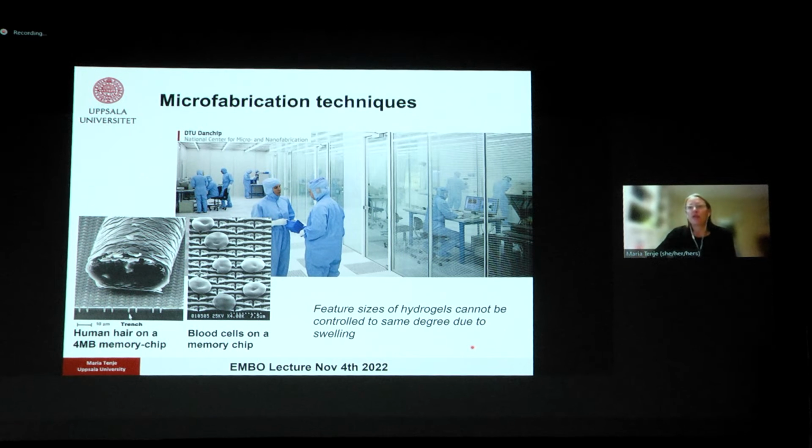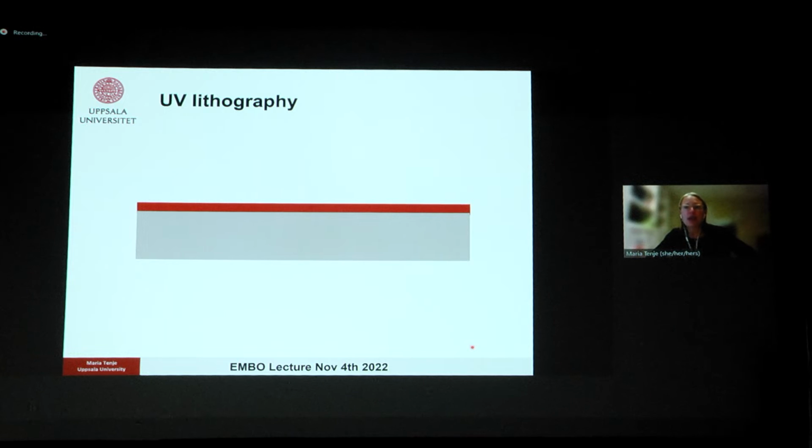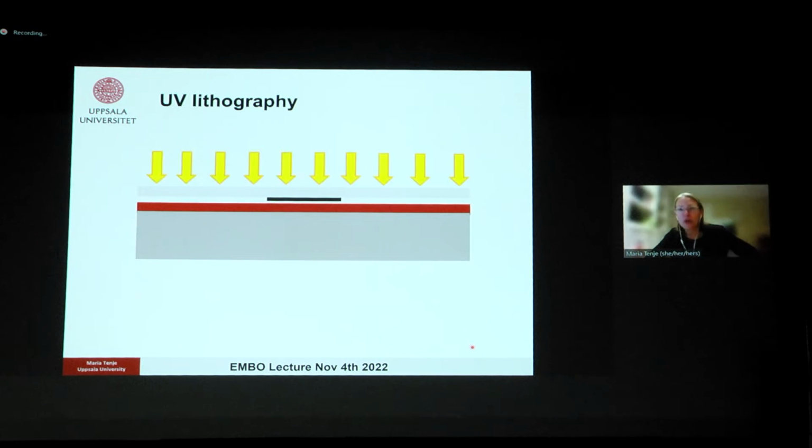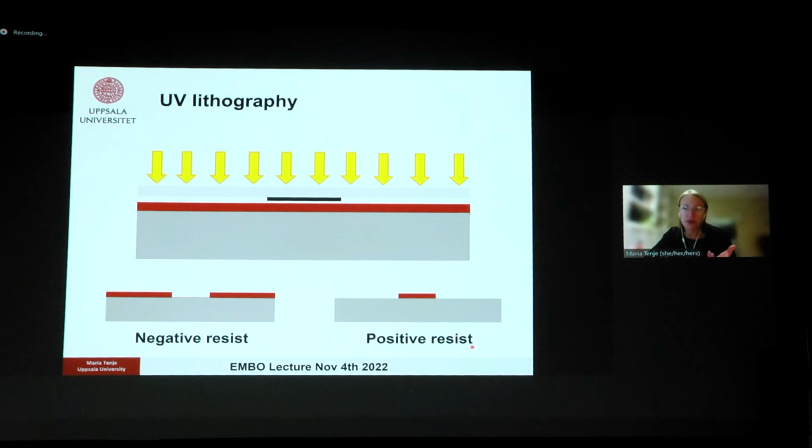And for microfabrication, really the workhorse is UV lithography. And just very briefly, imagine a cross-section: you have a substrate, you put a layer on top that is sensitive to UV light. You can bring in a mask and you expose to the UV light, and that can either form bonds if you work with a negative resist or a negative hydrogel, or it can break bonds if you work with what we call a positive resist, or a hydrogel that has been functionalized so that bonds cleave upon exposure to UV light.